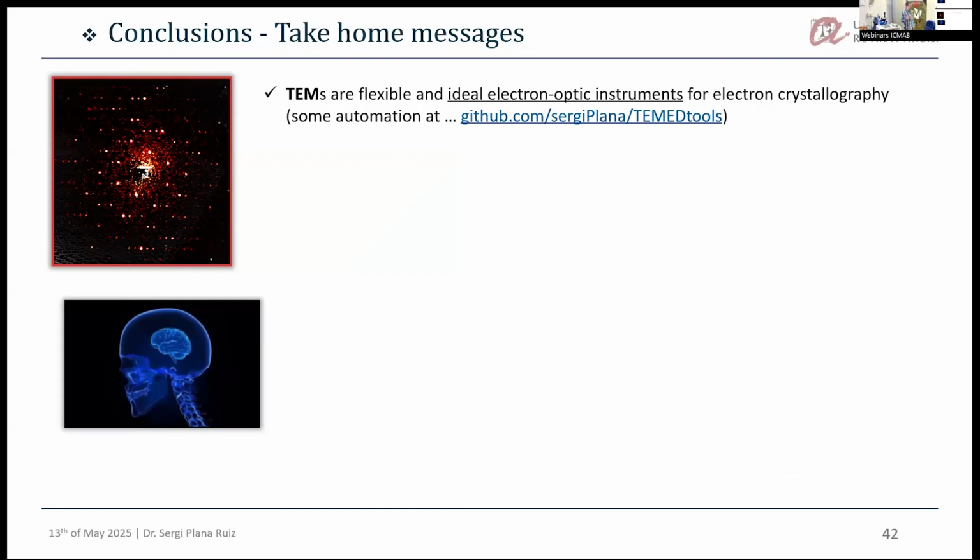These techniques, nowadays there are commercial solutions, modules that you can buy in your standard TEM, but the automation is key in order to have more systematic and reliable results out of this. In that respect, I have some scripts done and some plugins available in my GitHub repository. But what I want to send the message is that all TEMs can do electron diffraction. So think about that in order to make some electron crystallography out of your materials.